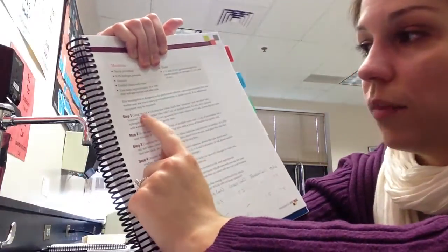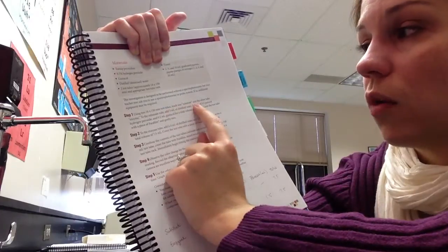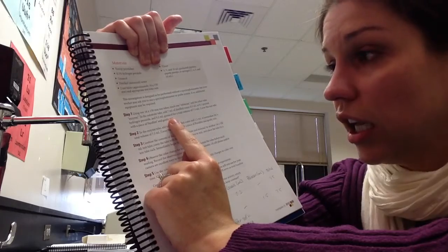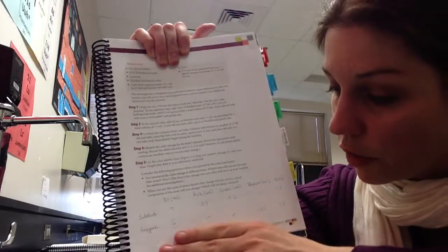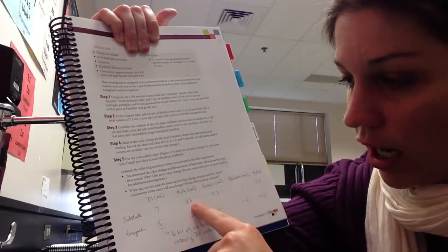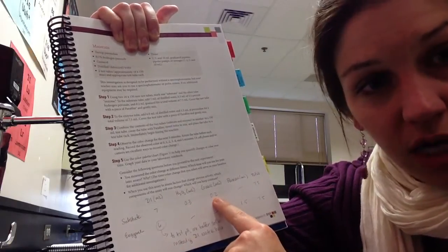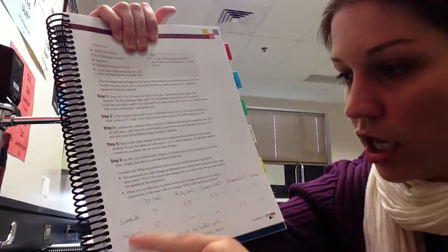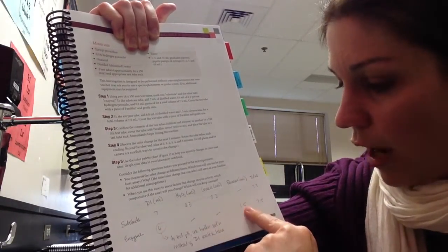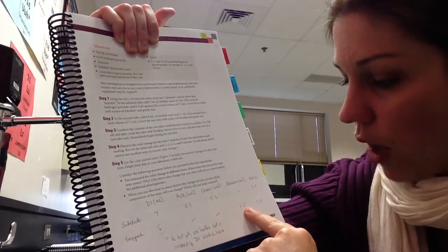And it's going to tell you up here to use two test tubes, mark one substrate and the other one enzyme, and then it tells you exactly what goes in each test tube. I want you to make a data table. And here's a hint. If you ignore this thing on the bottom, that's the answer. That's what's going in each test tube. Your substrate test tube has DI water, hydrogen peroxide, and your guaiacol in it for a total of seven and a half milliliters. Your enzyme test tube has six milliliters of DI water and one and a half milliliters of peroxidase.